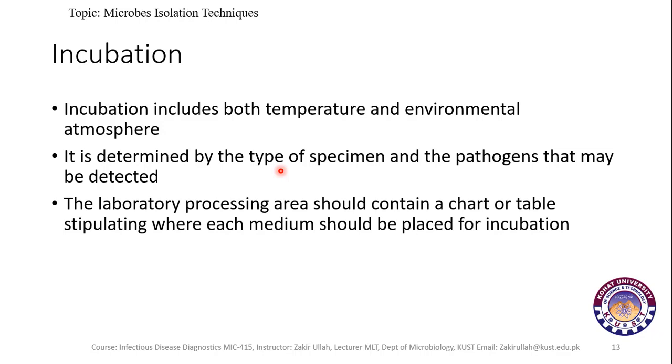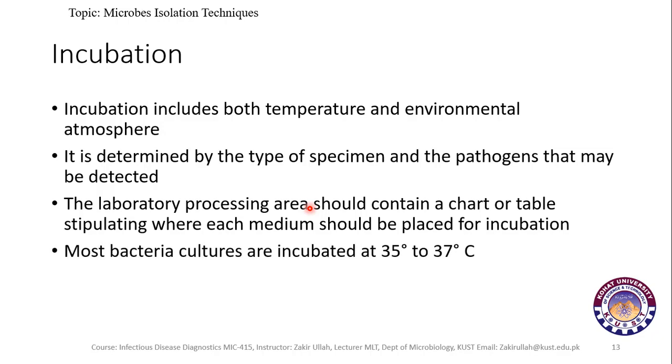It is important in every laboratory that the processing area should contain a specific chart or table which shows which medium should be placed for incubation and which type of specimen should be inoculated on which type of medium. Most bacterial cultures are incubated at 35 to 37 degrees centigrade.